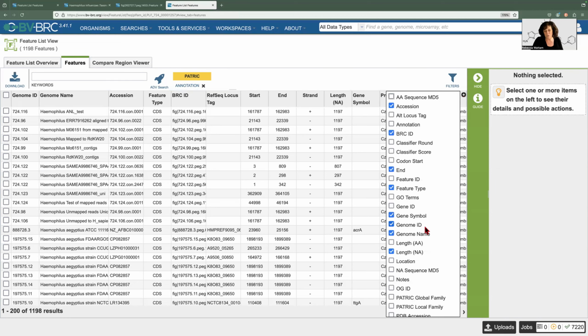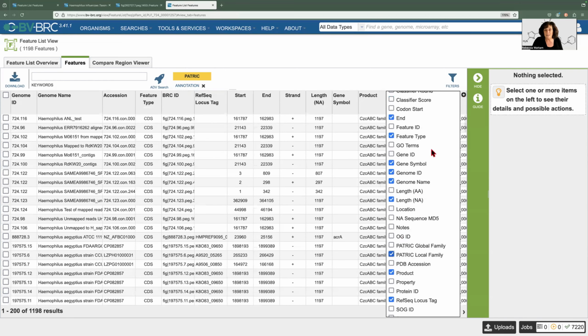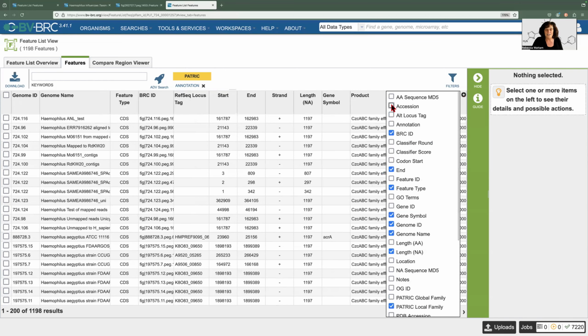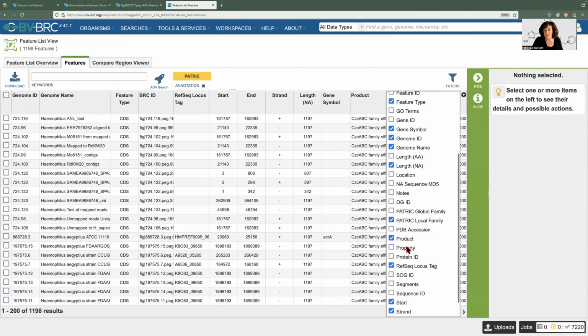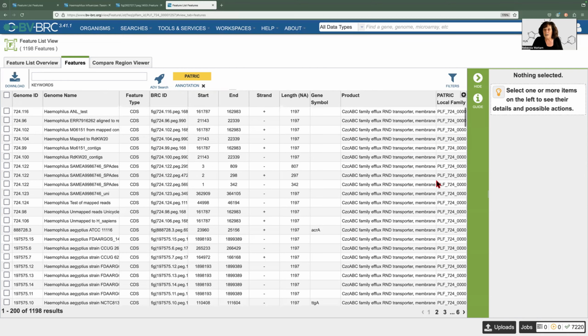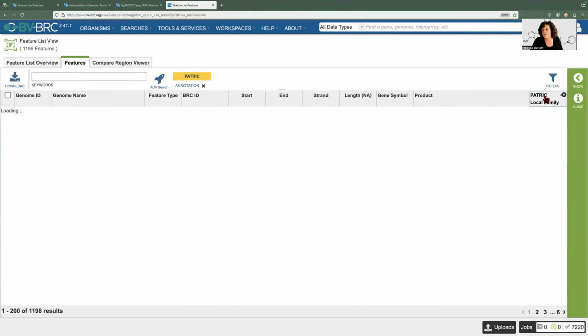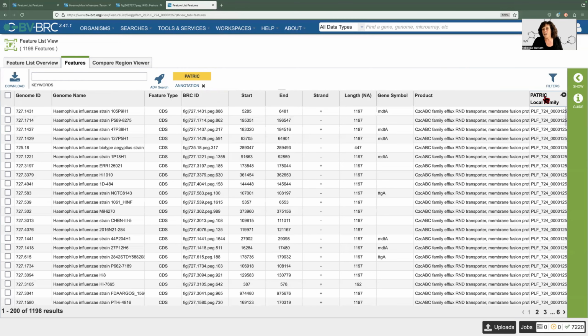This is really important. Well, it's not really important, but I like it a lot, so I do it all the time so I can check that. And the reason I do it is because I've gotten burned by this before. So I'll move this over. Okay, 125. Okay, they all have that same, and look at the gene symbols. They all belong to the same family.